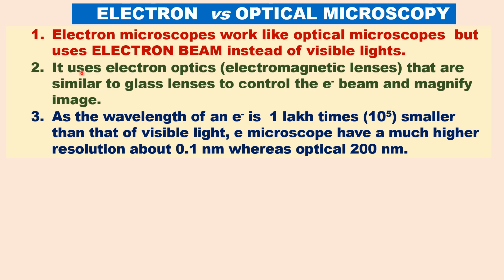Second point, it uses electromagnetic lenses, not glass lenses. In optical microscopy, we use glass lenses. In this case, we use electron optics, that is electromagnetic lenses, to control the electron beam and magnify the image.